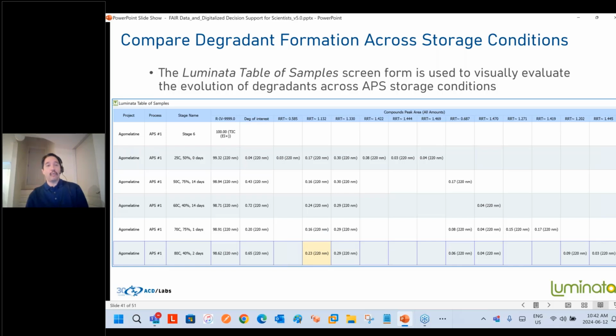Now, at that point, it's created this pivoted view. And remember, we didn't type anything in. There are no transcription issues. Everything was already processed, but all the metadata was taken in dynamically. And what you'll see here is that every row is just a differing time point. And very useful, all the rows are differing time points, and every column is a possible compound name or unknown, all taken in right away with all of the responses or numerical values. Like I said, automatically. Trusting your data is crucial here for your responses.